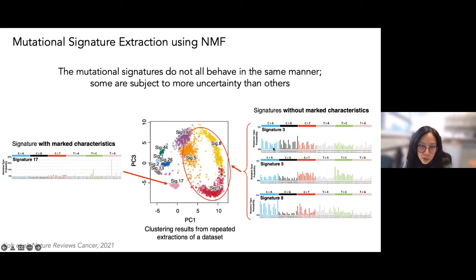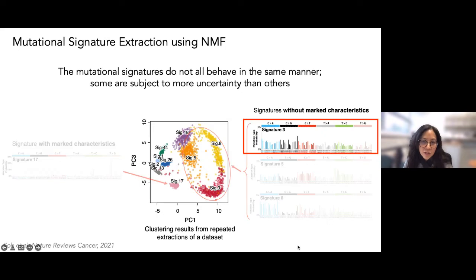And that's because if you look at the signatures, they're very flat. They've got a rather featureless profile as compared to that. And they get mistaken for each other rather a lot.